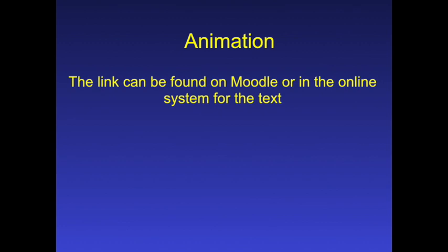And it takes more buffer for them to go. They actually fall through a larger volume because they not just go around, they fall inside like a little thing, what is it? Pinball machine. You cannot hit, and it takes them a lot longer to come off. And so you can see the three proteins are isolated by size.